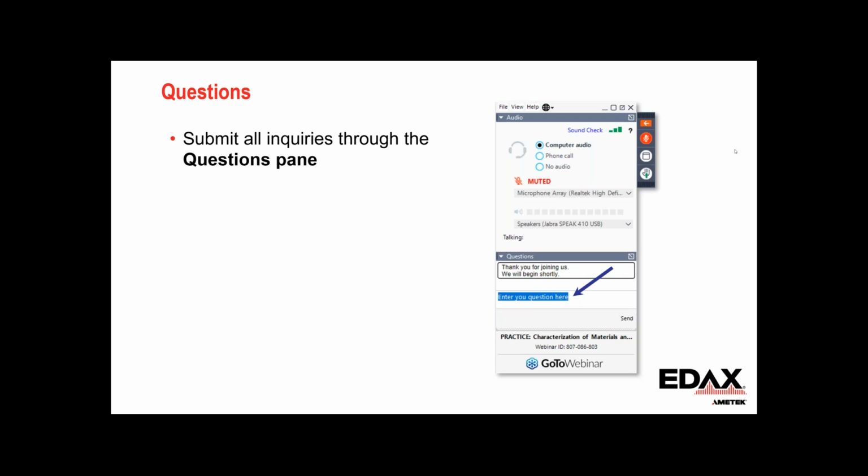All right, we have another question, Will, that will be good for you. Do multiple phases, and in this particular question for geological type phases, significantly slow down the forward model indexing methods? Yeah, so basically, just like with Hough indexing, time is going to be linear in the number of phases that you index against. So if you have 10 phases, it's going to take 10 times longer.